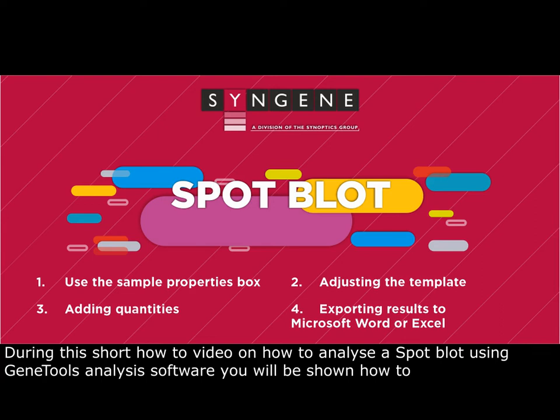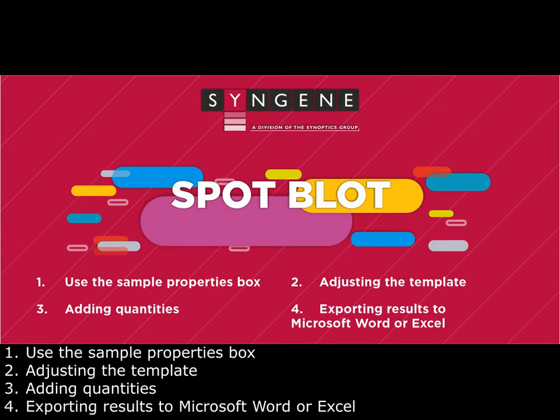During the short how-to video on how to analyse a Spotblot using GeneTools analysis software, you'll be shown how to: 1. Use the sample properties box, 2. Adjust the template, 3. Add in quantities, 4. Export results to Microsoft Word or Excel.